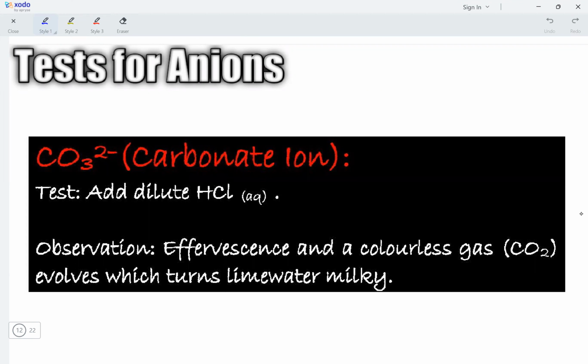Effervescence is basically bubbling observed in the solution, right? Now, since we are adding acid into a solution of carbonate, we would see bubbling in the solution. And if we add solid carbonate into a solution of an acid, again, we are going to see bubbling, but this bubbling would have a white colored salt and the bubbles mixed together because the carbonate is solid in the second example.